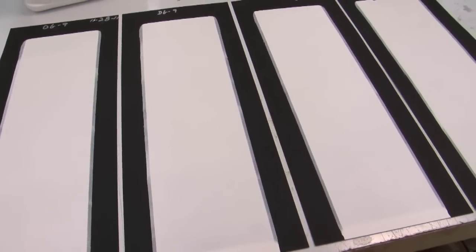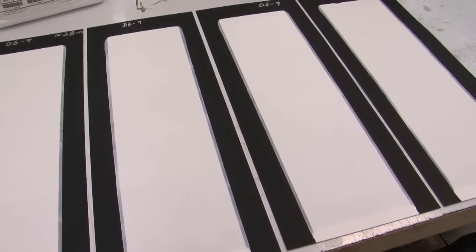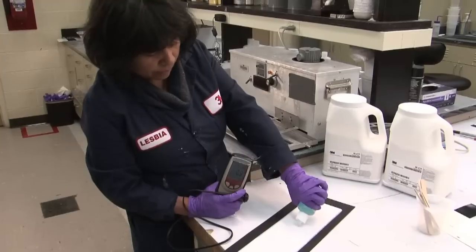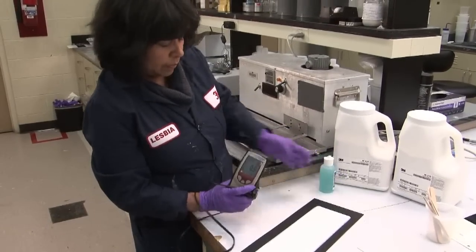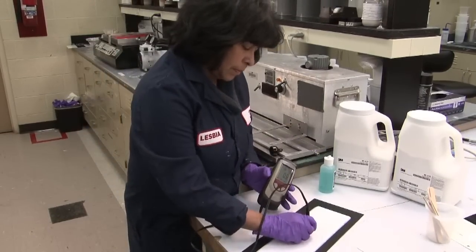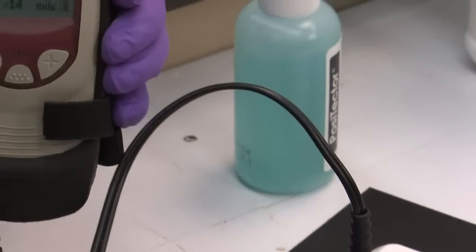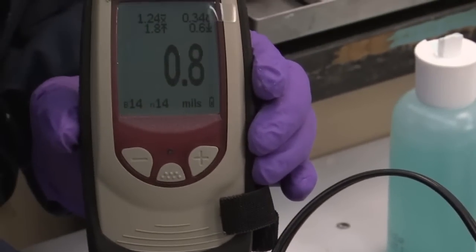Drawdowns for washability, scrub resistance, burnish resistance and gloss are left to dry for seven days. Drying times for other tests vary from several hours to a day. After the panels dry, we measure the thickness of the paint using a non-destructive ultrasound thickness gauge. Now our panel is ready for testing.